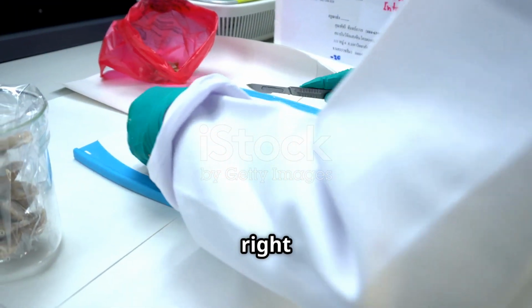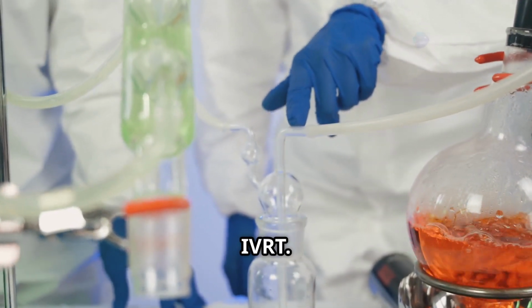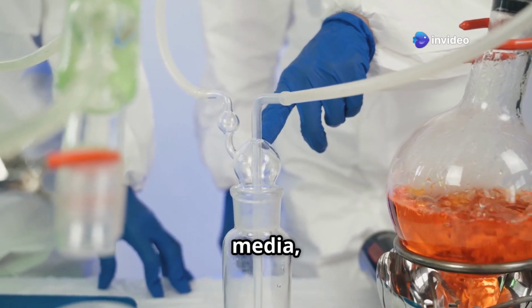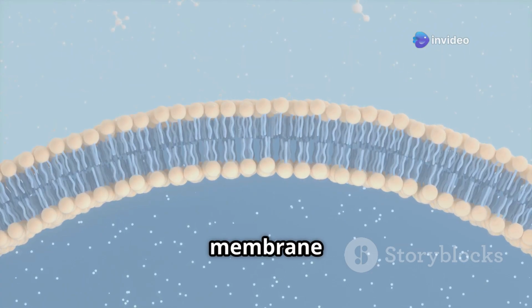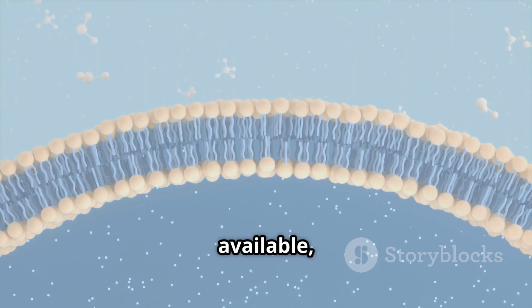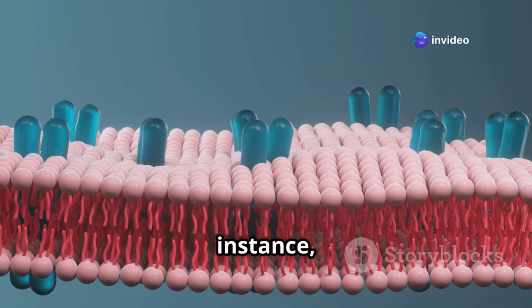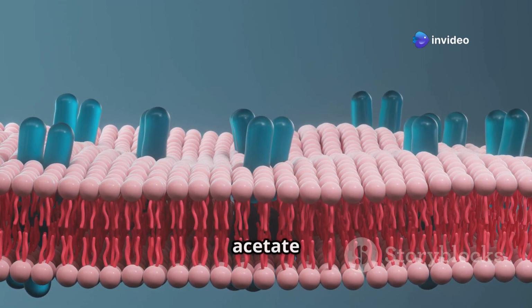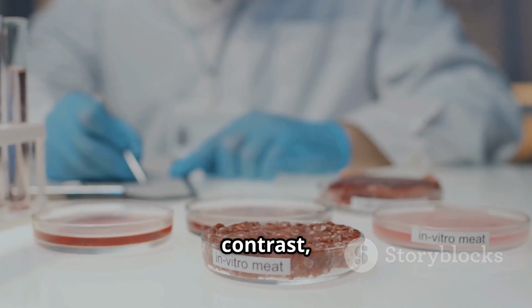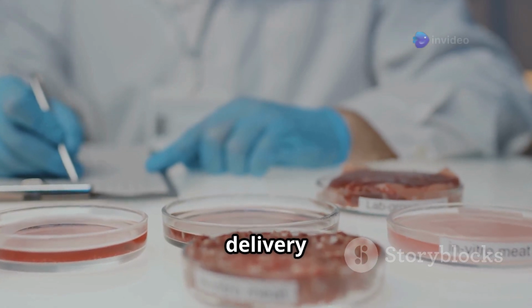Just like choosing the right receptor media, selecting the appropriate membrane is crucial for successful IVRT. The membrane acts as a barrier between the drug and the receptor media, simulating the biological membrane the drug needs to cross to be absorbed. Different membranes are available, each with unique properties that mimic different biological barriers. For instance, synthetic membranes like cellulose acetate are commonly used to simulate the intestinal lining. In contrast, natural membranes like pigskin might be used for topical or transdermal drug delivery studies.